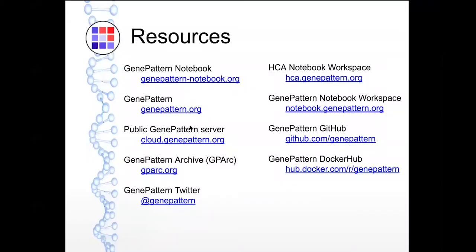So we have one question from Nikolai Thorin. He's asking if we have version control built into the notebooks. Do you want to take that? Yeah, so we have version control in as much as the Jupyter framework supports version control. What you can do is from a notebook, you can set a checkpoint, and then you could flip back to that checkpoint. From the command line, which is accessible right from the notebook, you can also do any sort of git checkout or push or pull the different Git repositories. And that's another way to do version control if you're familiar with Git.